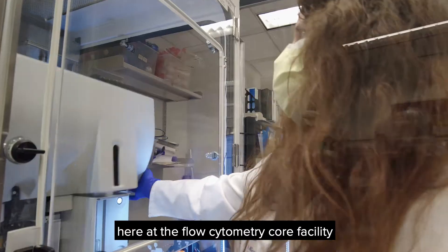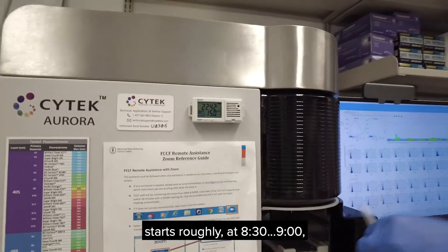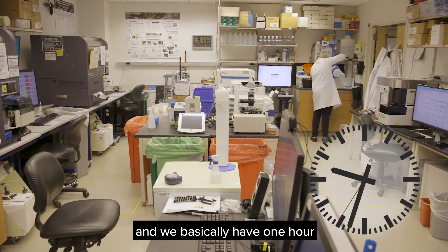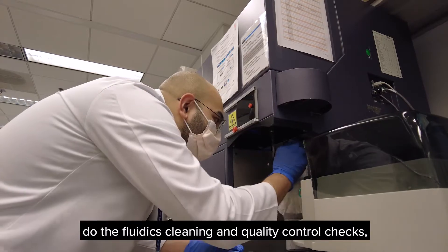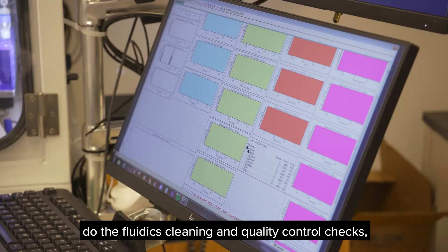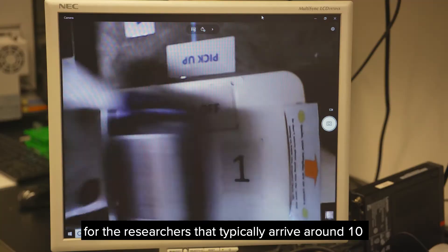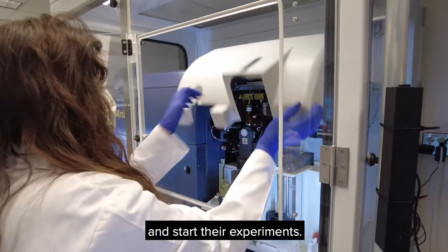The morning routine here at the flow cytometry core facility starts roughly at 8:30, 9 o'clock, and we basically have one hour to set up all the instruments, do the fluidics cleaning and quality control checks, so that we make sure that the instruments are performing well for the researchers that typically arrive around 10 and start their experiments.